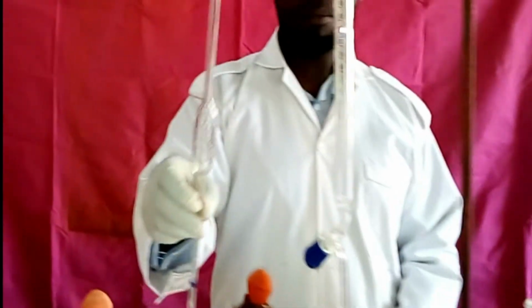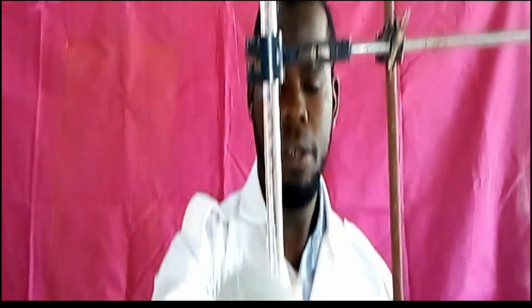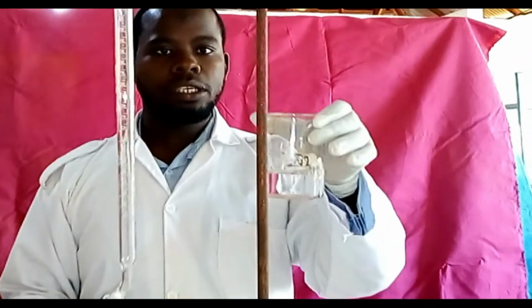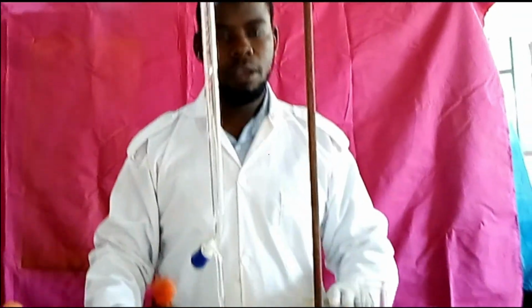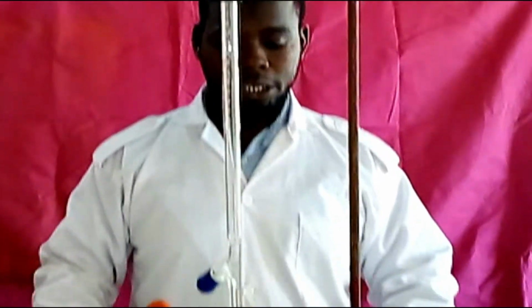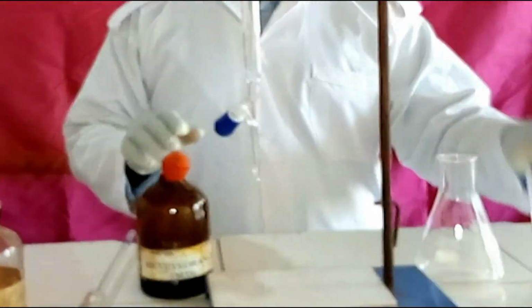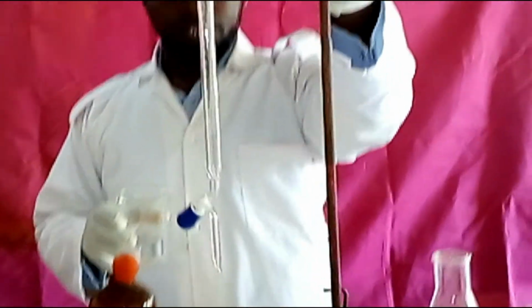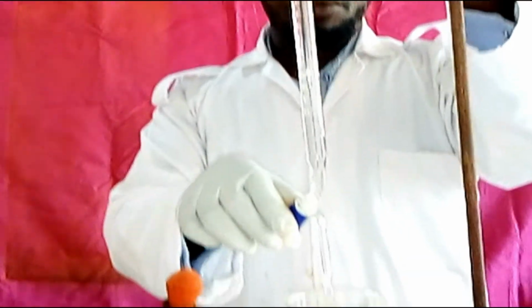Then we have a pipette, that is a 25 mL pipette, and this is our burette for the acid, and this is the acid solution. Also we have a conical flask. This is the setup of our titration apparatus. Let me start the procedure. The first procedure: we fill the burette with the acid solution. Make sure you fill up to above the 0 in order to fill the tip of your burette.